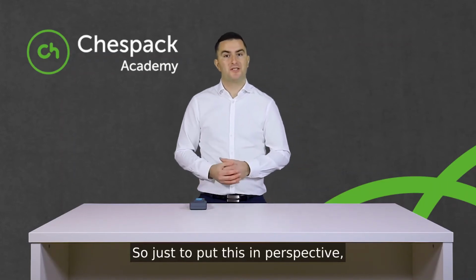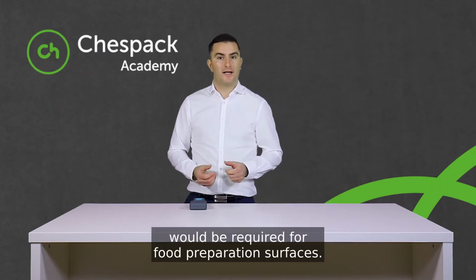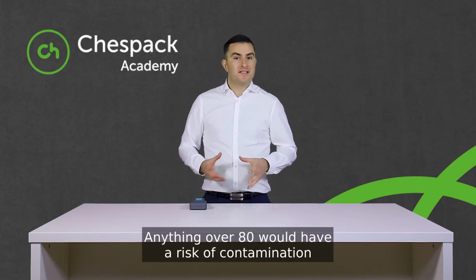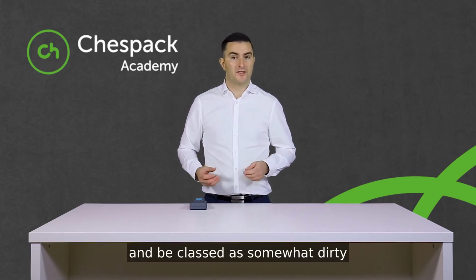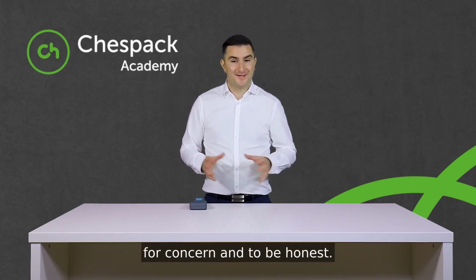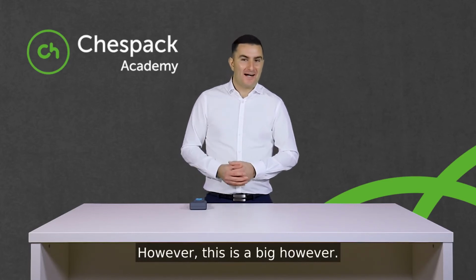So just to put this in perspective, readings anywhere between 0 and 10 would be required for food preparation surfaces. Anything over 80 would have a risk of contamination and be classed as somewhat dirty. And anything over and above 500 is a cause for concern, and to be honest, I'd just tell you to get out. However, this is a big however.